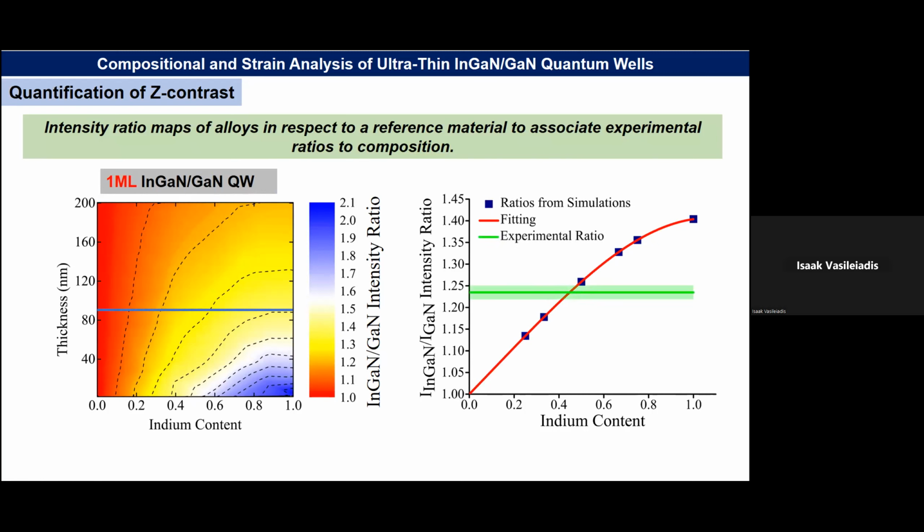By comparing the experimental intensity ratio to this behavior, you can find directly the indium content from the intensity.